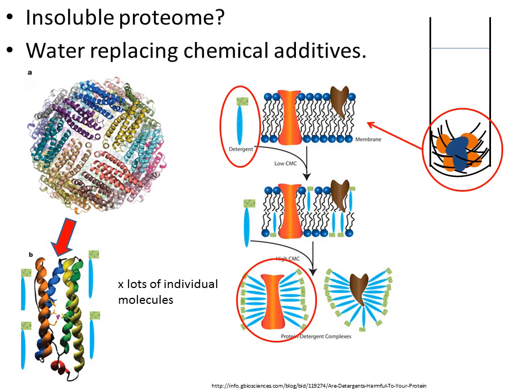Often a chemical additive is added and then needs to be removed again at a later step to prevent it interfering with a certain technique. The chemical additives can be divided into a few groups. The first group we'll look at are chaotropes.